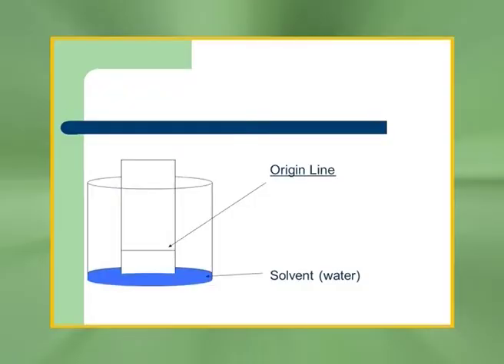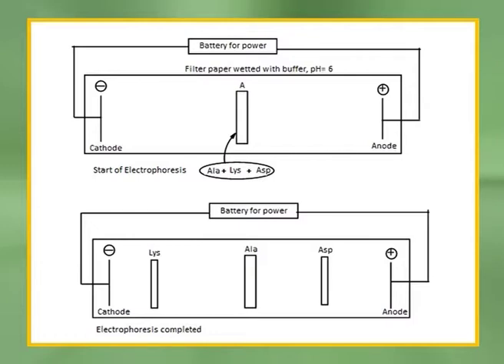If the electrophoretic migration towards both poles of the system is anticipated, the origin line should be in the center of the paper. If migration in only one direction is anticipated, the origin line should be near one end of the paper. After the solvent containing the samples has evaporated, the paper is dampened with the electrophoresis buffer, either by uniform spraying or by dipping and blotting the ends of the paper so that wetting of the paper from both ends meets at the origin line simultaneously.